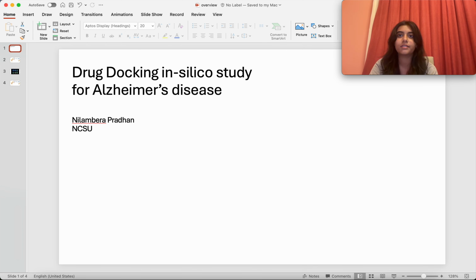In this video, I will show a complete drug docking simulation in the context of Alzheimer's disease. In silico studies are very important for screening drug candidates. It can save years in the drug design pipeline by narrowing down the list of viable drugs and thus bringing down the overall cost of drug development.